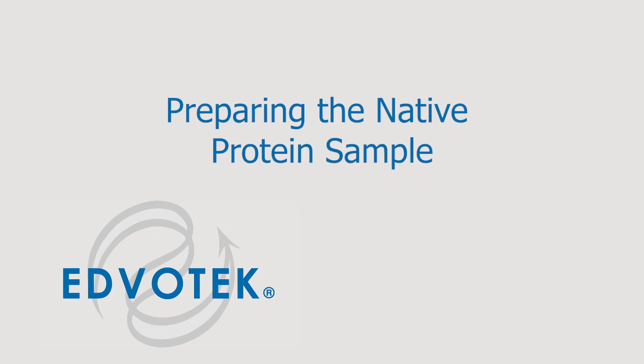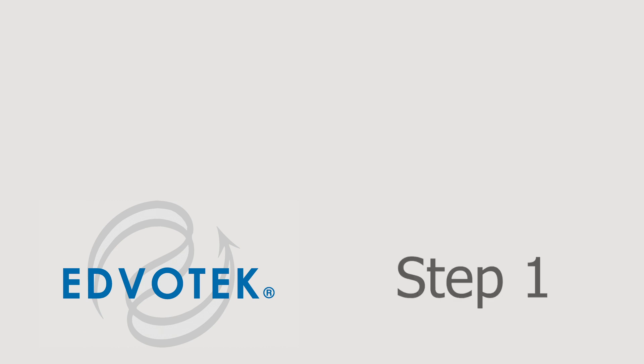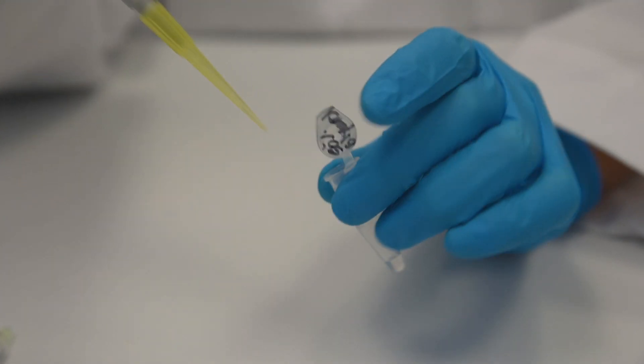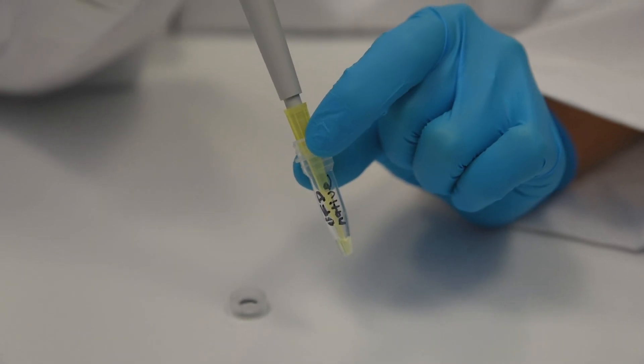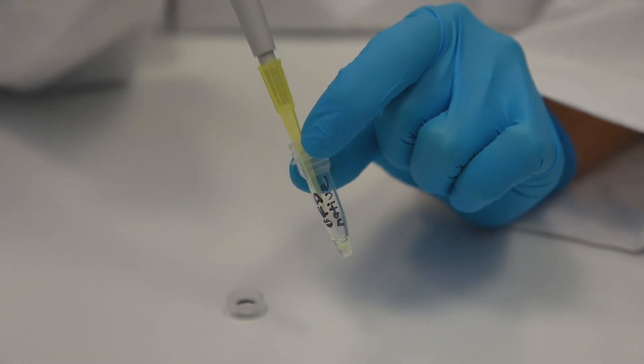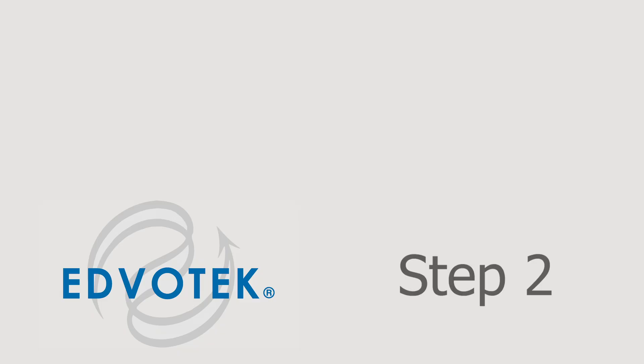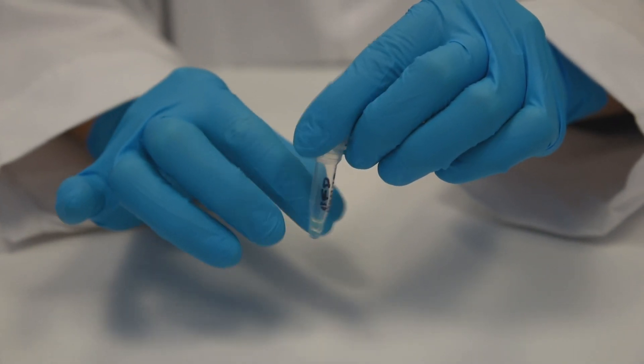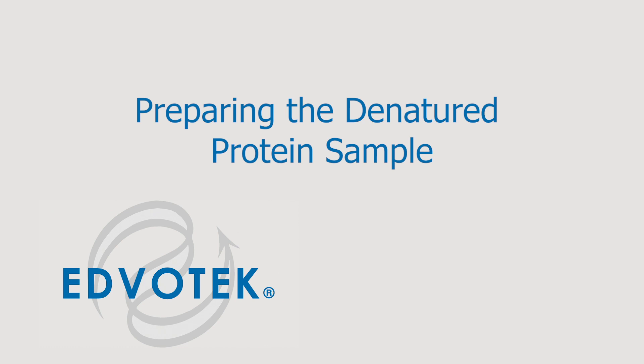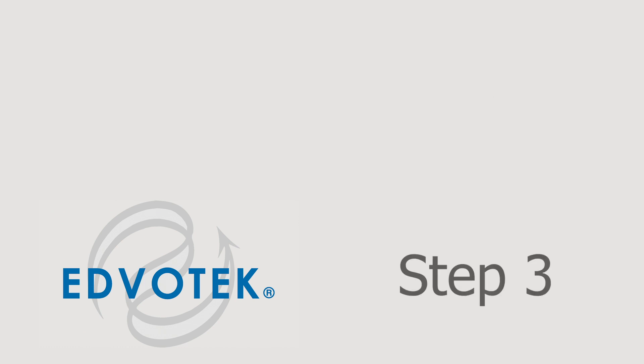Preparing native protein or unboiled sample. Step 1: Add 10 microliters of 50% glycerol to the tube labeled GFP native. Step 2: Mix and set the tube aside for electrophoresis.